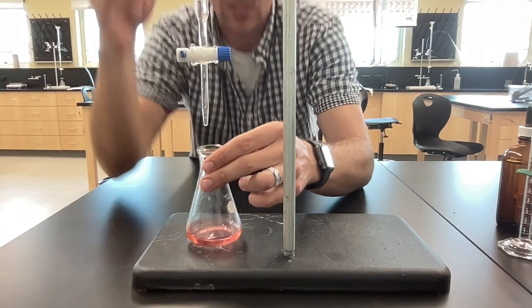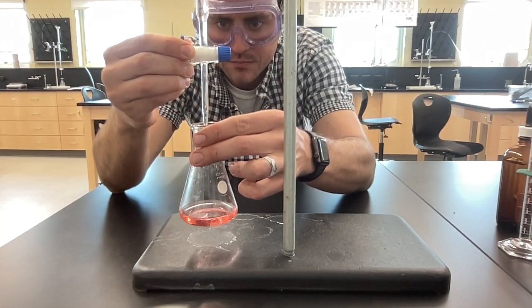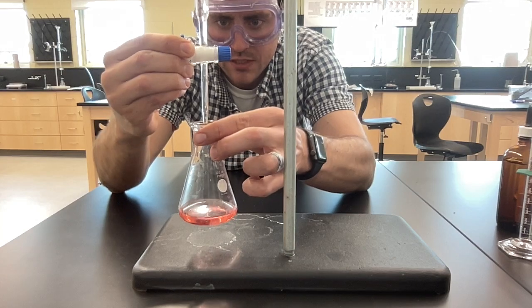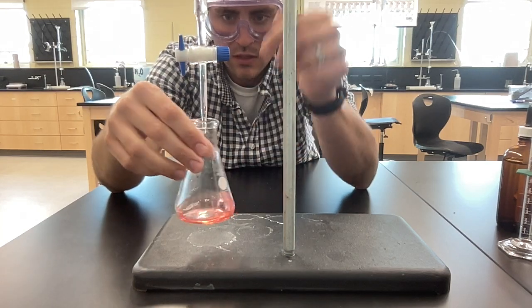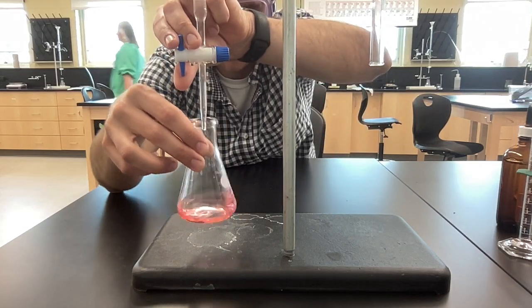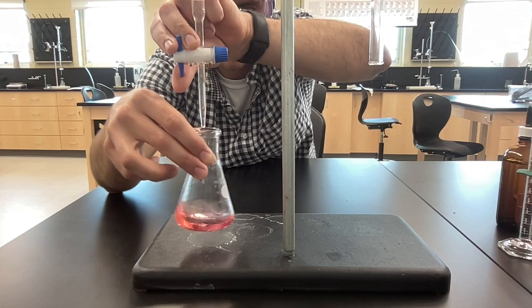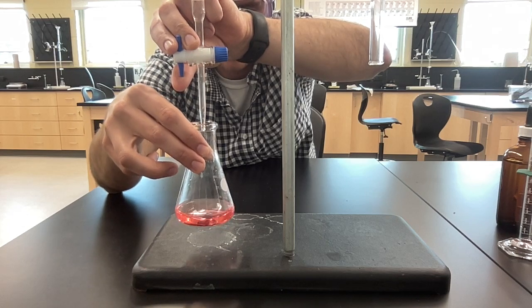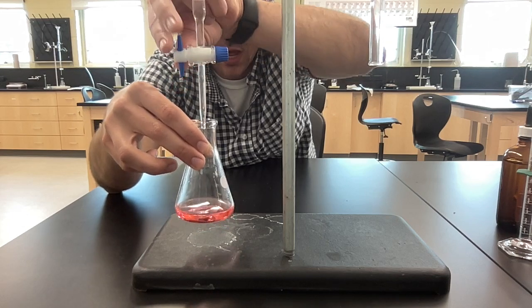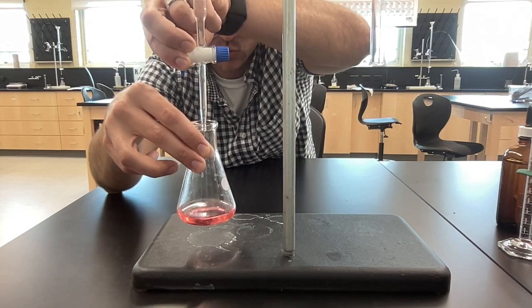Let's add things a little slower now, maybe drop by drop, and see what happens to this color change. I'm a righty, so I have to crisscross my hands. Anything crazy happening? I see purple showing up, but not staying. When I swirl it, it goes away.